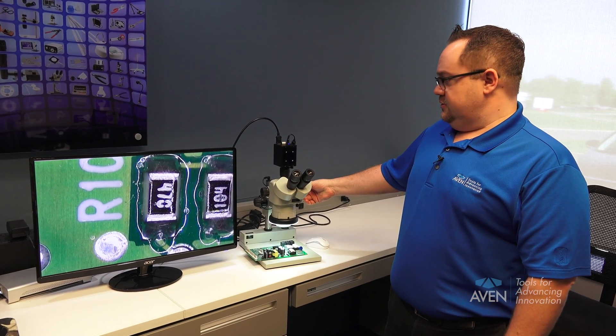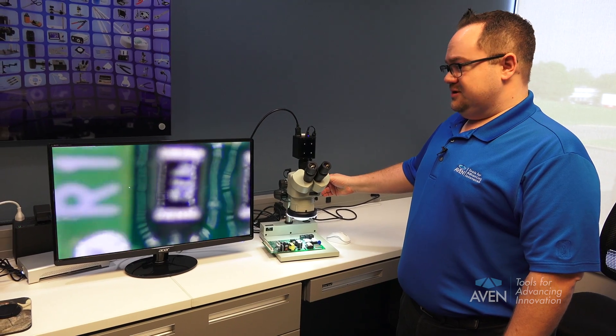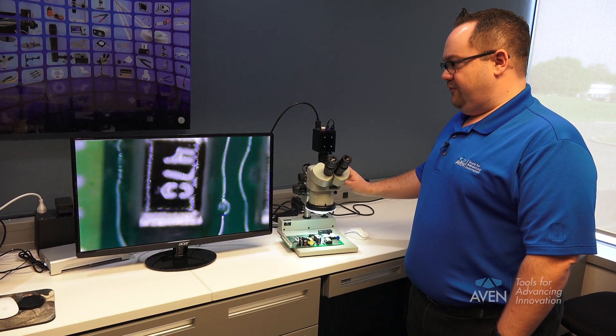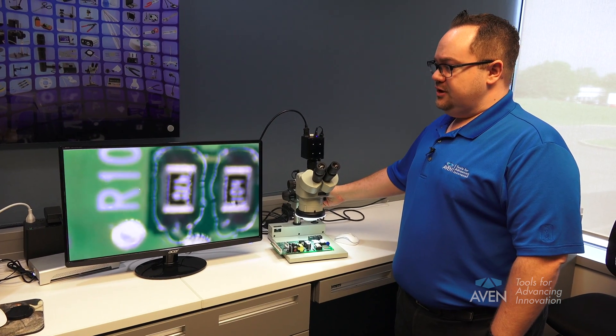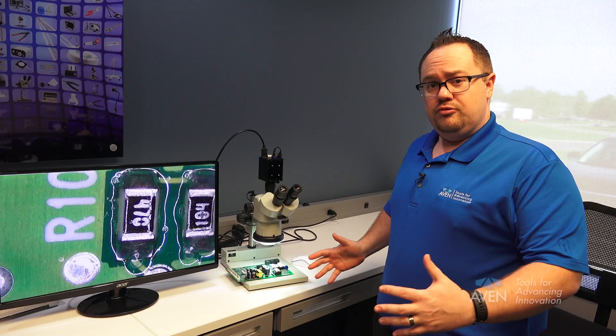As you can see with this scope here, we see a lot of users moving in and out of the range where it's not in focus perpetually. They're moving the objective up and down to stay in focus at different magnification ranges. We're going to show you today how to keep it parfocaled and in focus all the way through the range.